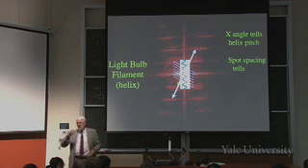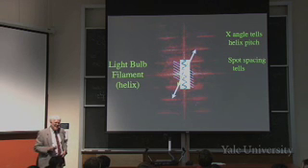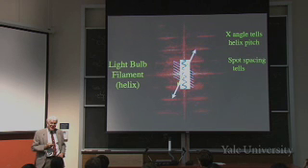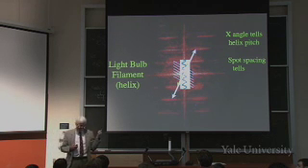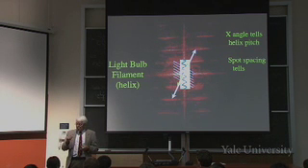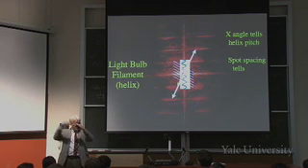What does the spacing of the spots tell you? Did you do the homework I suggested for today that you didn't have to hand in? Then you'll know what the spacing of the spots tells you. If you know the wavelength of the X-rays, or of the light in this case, the spacing of the spots tells you the spacing of the planes. It tells you what the actual distance is between successive turns of the helix.